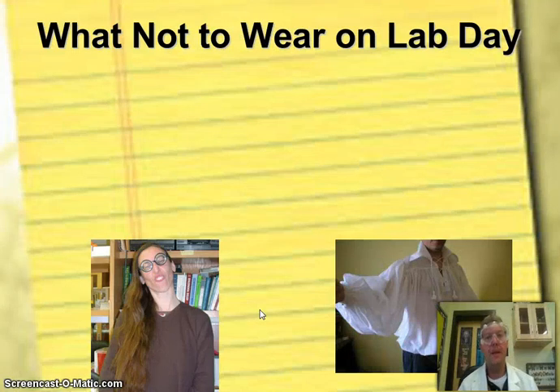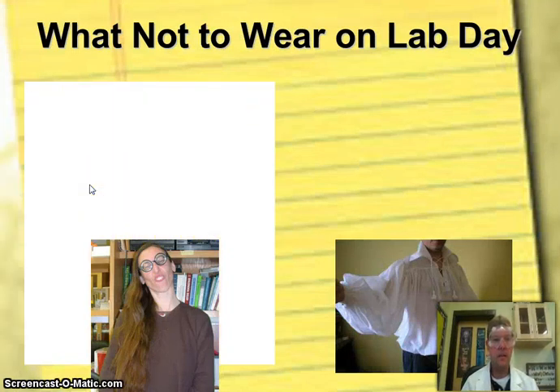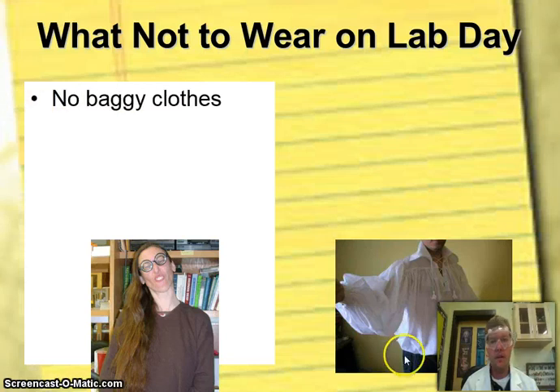Now, what should we not wear on lab day? Number one, let's go ahead and take a look here. No baggy clothes, kind of like this guy here, baggy sweatshirts. Those types of things can lean over, get within the chemicals, and even catch fire if we're using flames.